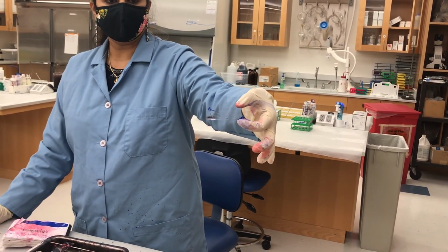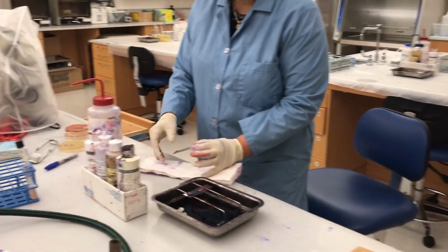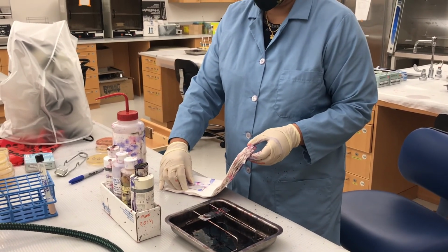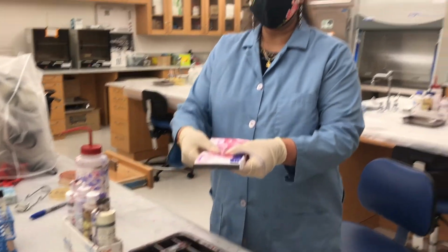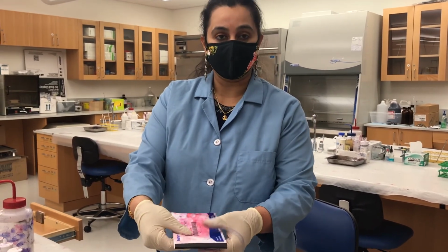Here is the solid culture slide, and before you look at the cells under the microscope, the most important thing is to make sure your slide is completely dry. We do this by gently pressing the slide using the bibulous paper.